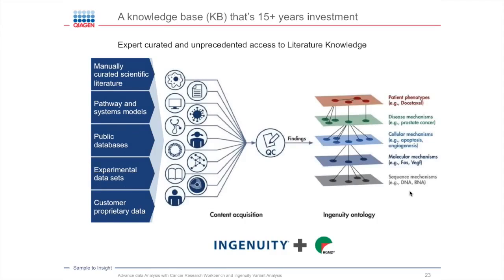We also do pathway modeling, importation of different public database, and you will see that when I will go directly within the tool, the type of database that we are importing into the tool. And this is what is behind variant analysis. What is actually the platform that allow variant analysis to help you identify those causal variants?